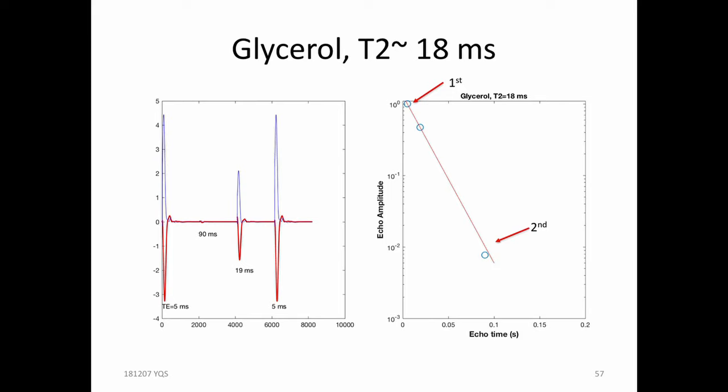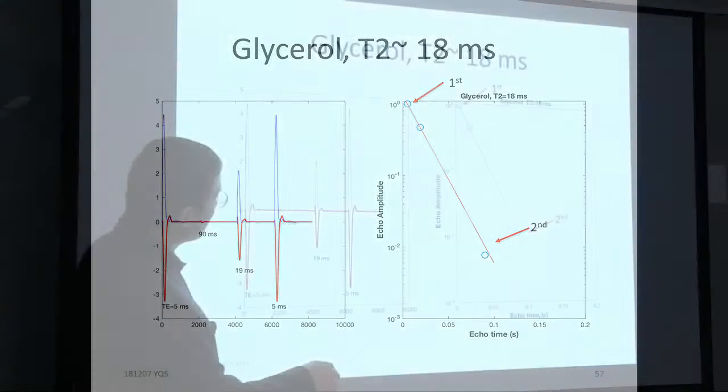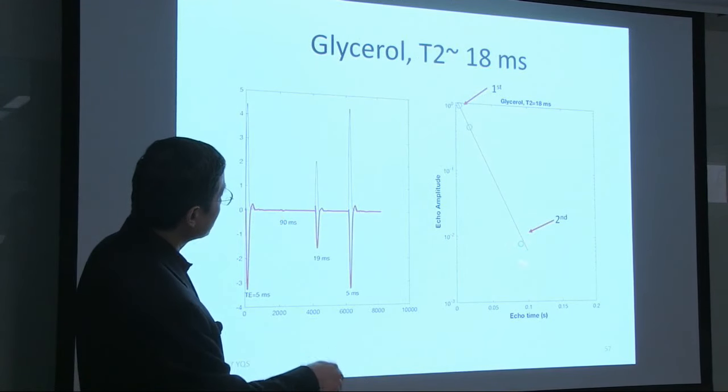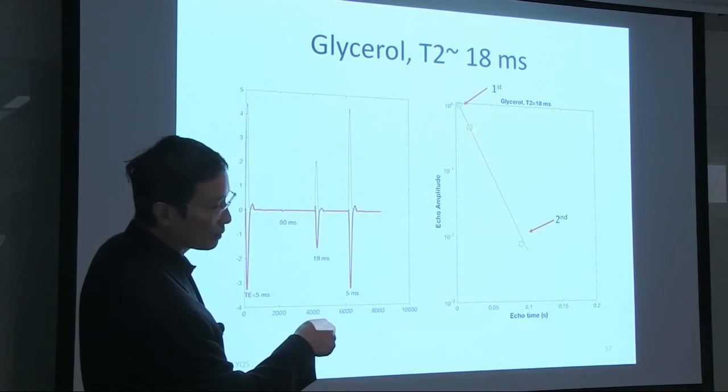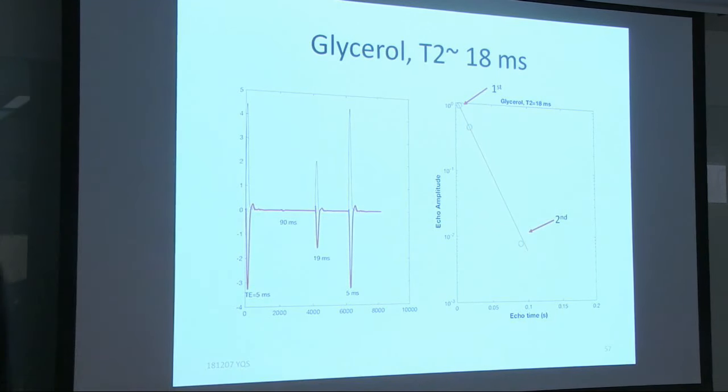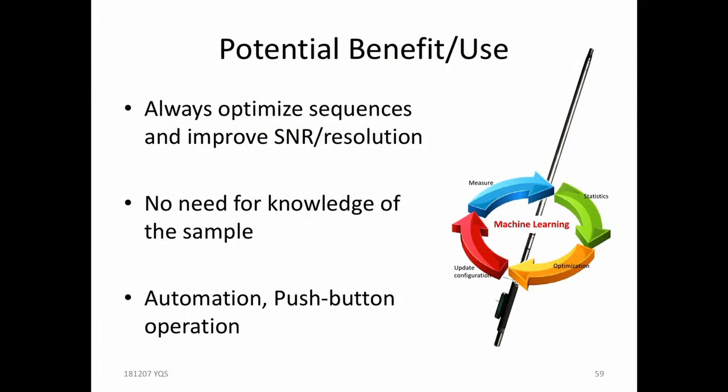And this is another example. It measures this first, and the second one it measures over here. Once it got here, it realized this had decayed way too much, so it automatically put another point here. And you can go on and try these things. It's mathematically quite simple, as long as you know how your signal should vary, or the other way of saying, you have a forward model, then you can do all these statistics that are quite straightforward.